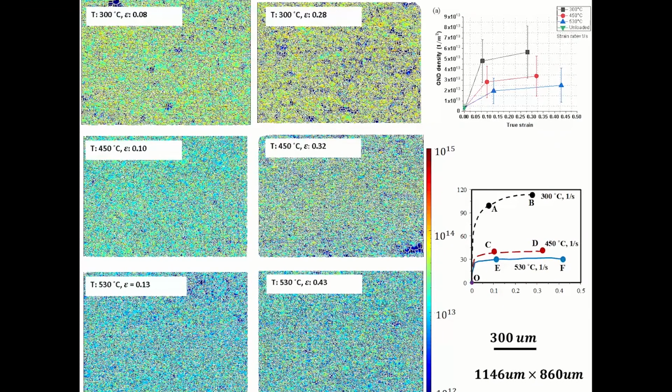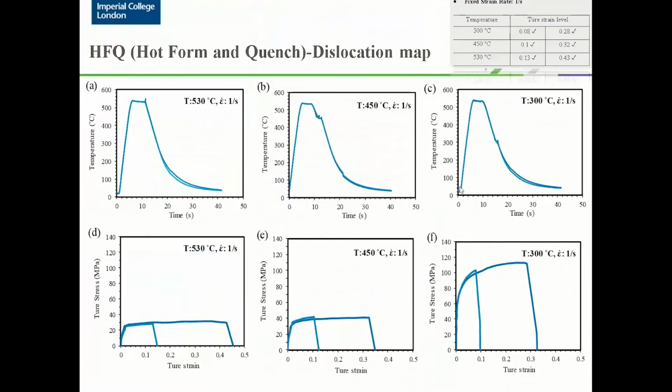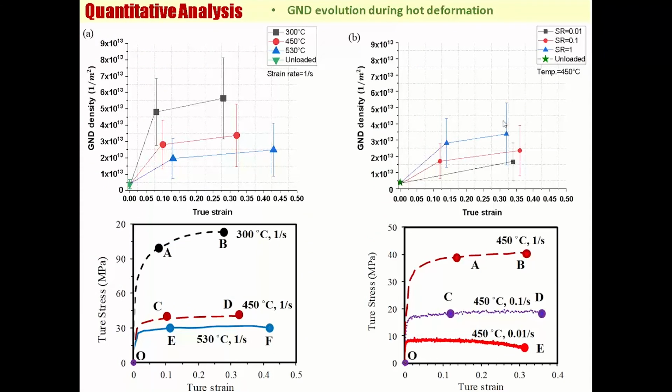So again, on case study 2, it said, I see that you vary both the strain and strain rate at a fixed temperature. If so, how do you know the contribution of each, meaning strain and strain rate, on the dislocation density? The strain and strain rate are combination effects. Strain rate also depends on how long we soaked or deformed the material.